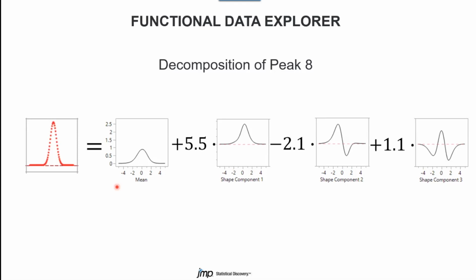If you used B splines, then it would look like a linear combination of piecewise cubics. If you used wavelets, it's a sum of wavelet basis functions. So the actual individual function itself would probably be pretty complicated because it would be some kind of spline model or wavelet model that has a lot of coefficients to it.